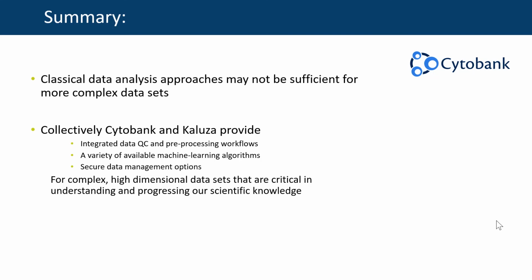We have secure data management options available for you within Cytobank, so you can access your data anytime, anywhere. Especially during a time like this, it's going to be extremely useful to be able to access everything that you've been working on. We're going to be able to do all of this for complex, high-dimensional data sets that are critical in understanding and progressing our scientific knowledge.